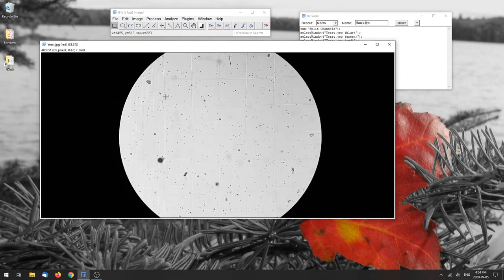The next thing we need to do is crop the image down to the particular area of the hemocytometer where we do our counting, which in the case of mine is this 4x4 grid area here. But you might notice that we're actually slanted very slightly. So I didn't quite have the hemocytometer horizontal when I took the picture. So we can fix this.